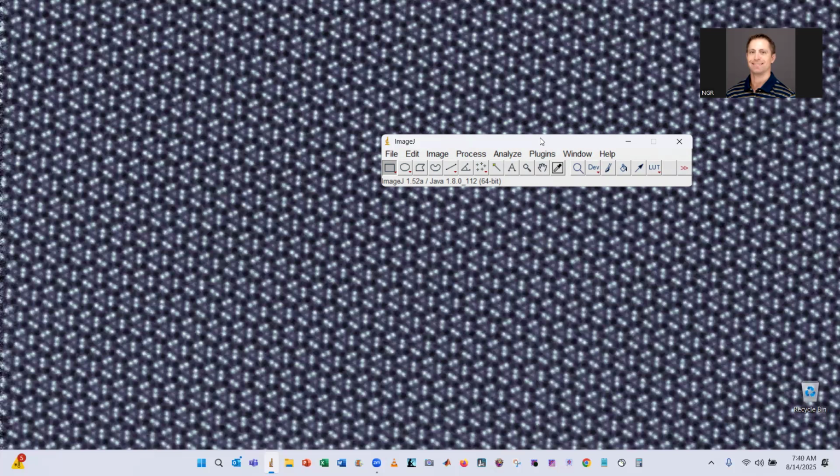Whether that's, like, I have MATLAB scripts for this, or I know there's a program, Pi 4D-STEM, right? I'm not sure how that works, but generally speaking, I believe you actually have to export the individual diffraction patterns to do that. So I'm going to show you how to do that with ImageJ as well.